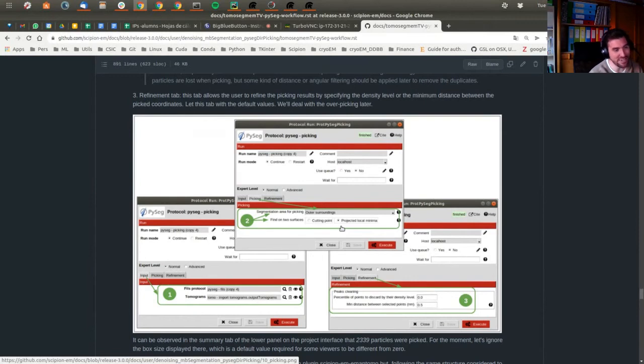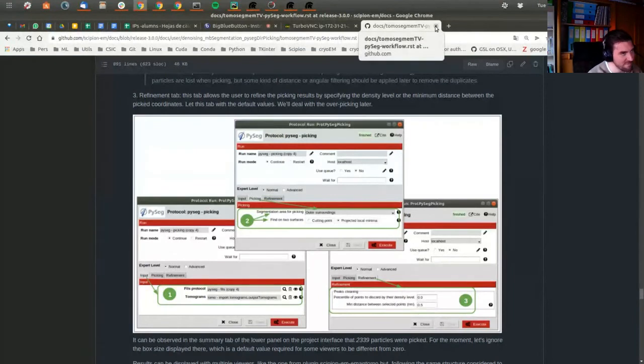And finally, you can apply a small filter. It is not edited here because we are going to use another protocol which filters by distance and by normal very, very fast, just not to keep you here until very late. I was trying to be faster than finishing at 5:30, but it won't happen today.